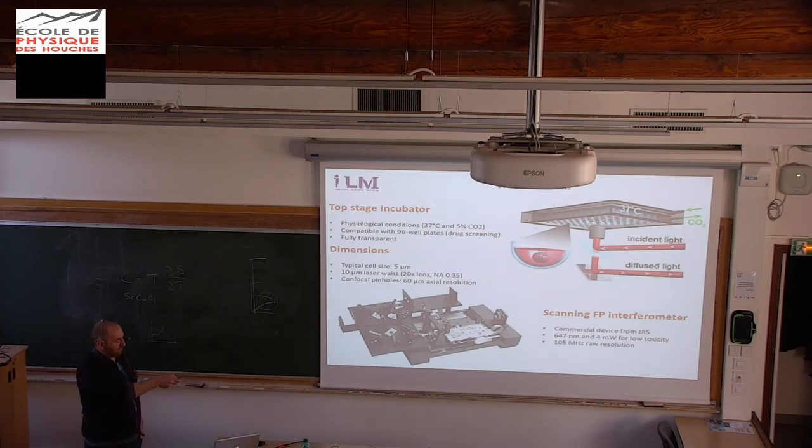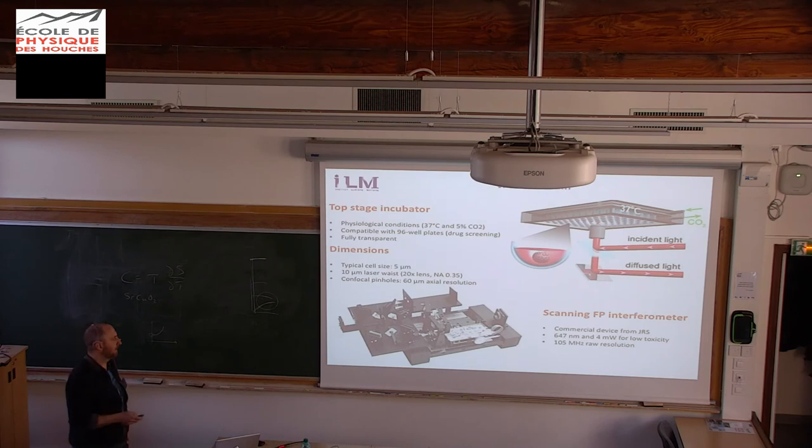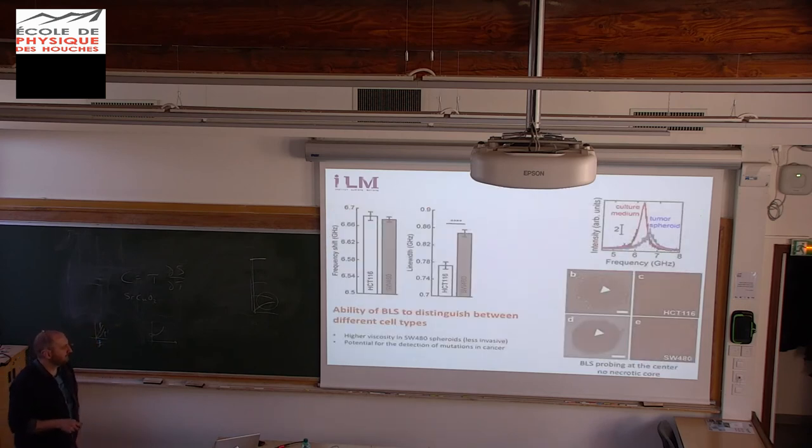And we control the temperature and the medium. We put CO2, so they are alive, because our measurement takes some days. Okay. And we look at the mechanical properties of the system.